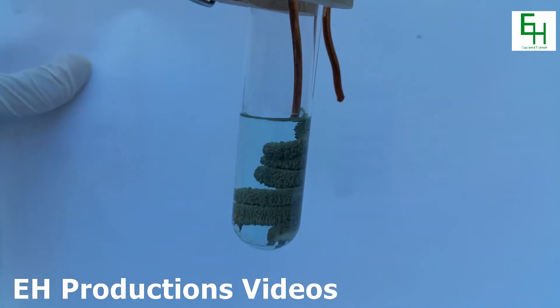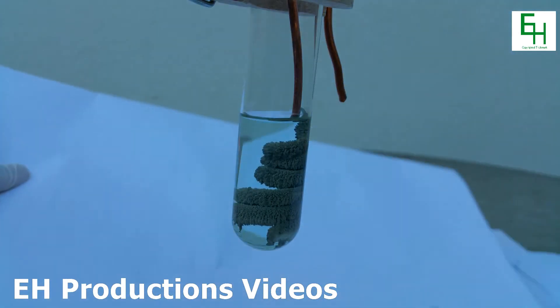And also, as you can see, the solution has turned a pale blue color due to the copper nitrate that has been formed.